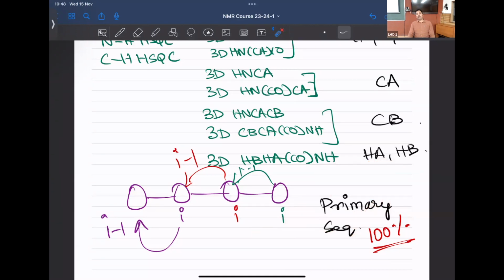So this way, what will happen? The protein that's being synthesized will be labeled with 13C and 15N, 100% label or 99% label. So this way, every atom is NMR active except for the carbonyl oxygen, right? So I hope this makes sense, and therefore you will be quite confident in the primary sequence that you're starting with. Unless you have trouble where there is too much chemical shift degeneracy and overlap, then you need higher dimensional NMR experiments to get further information to resolve the degeneracy.